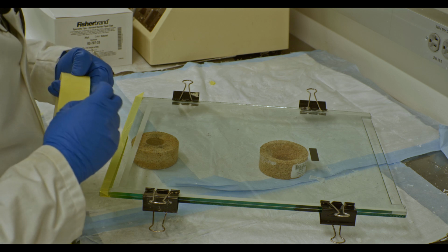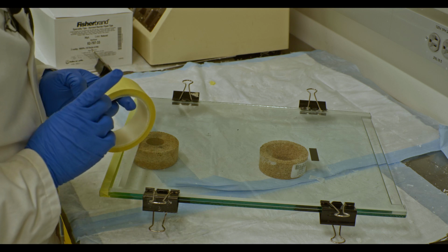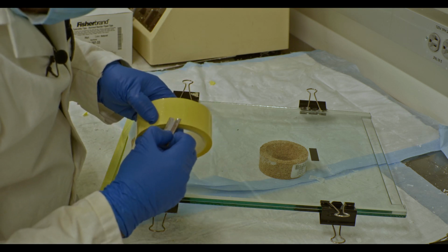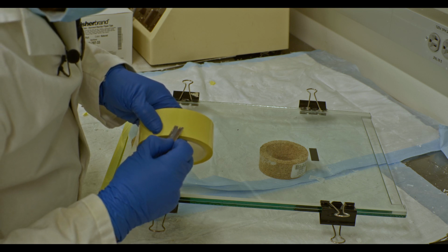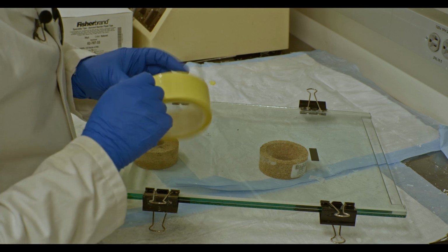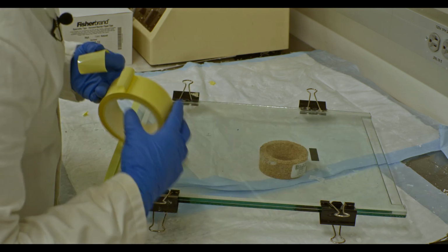The other thing is that you don't necessarily have to tape up the corners. And of course, if you do need some help getting that tape off, you can get a tiny little razor blade to effectively get one of the corners. But as long as you seal the bottom quite well, you don't need to actually seal the sides of the plate. You can, and in my experience, you should. If anything leaks out of the corners, it can leak out of the sides. So you should just tape everything, minus the top.